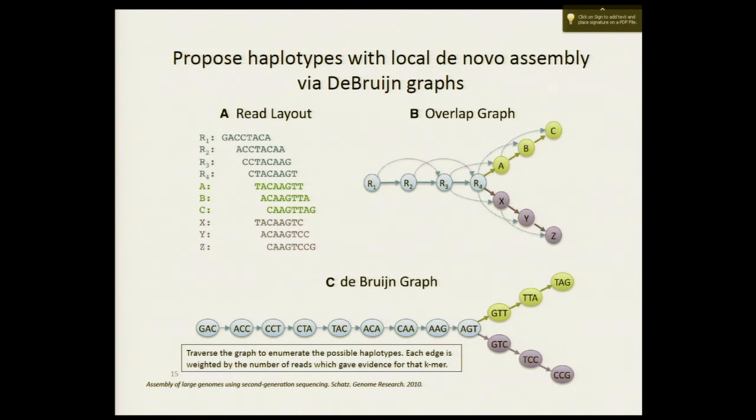So this is what an assembly graph looks like. You have these reads, and you're looking for overlap in the reads. Here's a bunch of reads that overlap. What you'll notice is that they're all the same until you get to the end. These reads have TA, and these reads have CC. So there's a multinucleotide polymorphism in these reads. TA goes to CC, and otherwise the reads match.